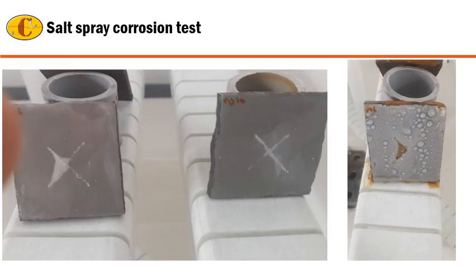And this is just an example of how the coating degradation will look over a period of time. So you have a scratch, and then over a period of time the moisture will go inside the scratch. If your coating is good, nothing will happen to the coating. That way you can see exactly where the corrosion is going to happen also.